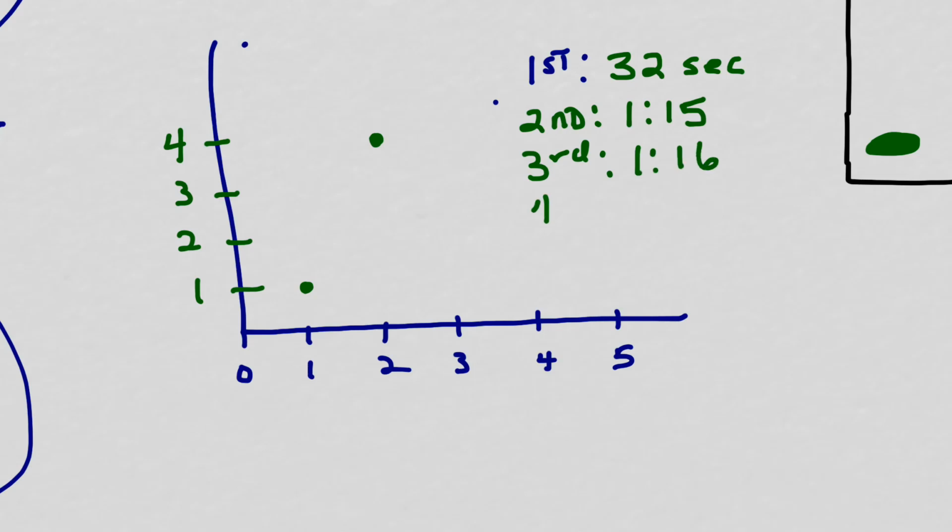We had a grouping of them, and you can see why it's probably advantageous to do it this way, because as disks start to rise in groups, it's hard to measure exactly when they come up. But if you give them a range or a frequency for the range, it's definitely a better way to do business. So let's pretend that this is our data. Let's say the 5th, and we'll just leave that alone. So what do I have here? I have a grouping. The second, third, and fourth disk arose between the first and second minute.